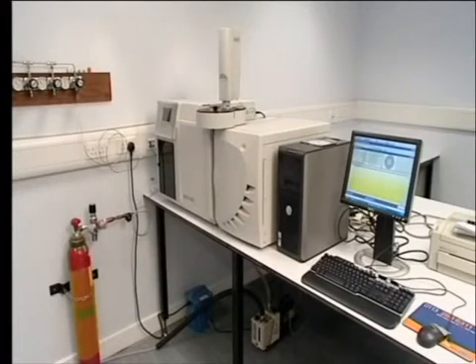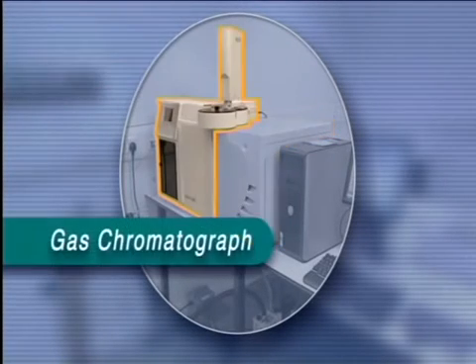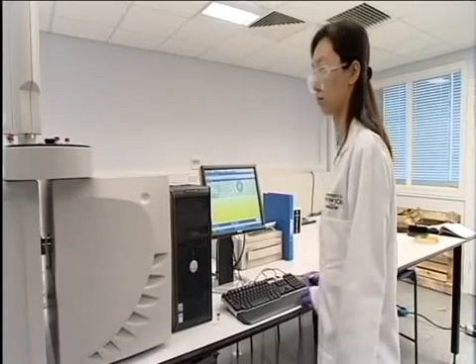Many mass spectrometers are of desktop size. This one takes in samples from a gas chromatography instrument. As each component comes off the gas chromatography column, it is fed directly into the mass spectrometer. The combined technique is called gas chromatography mass spectrometry, or GCMS.